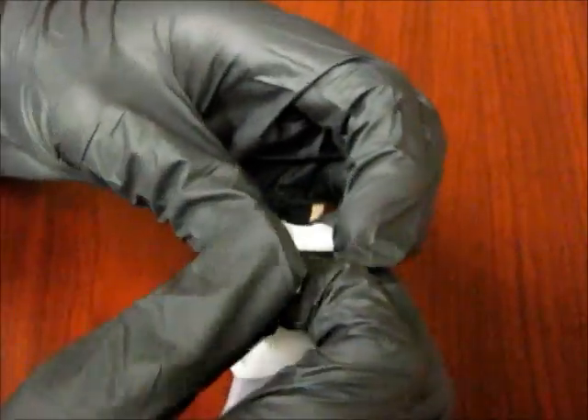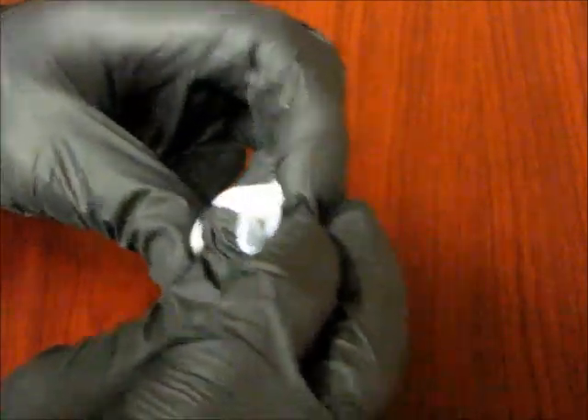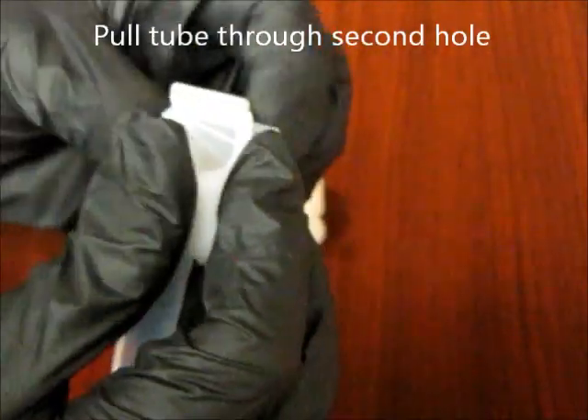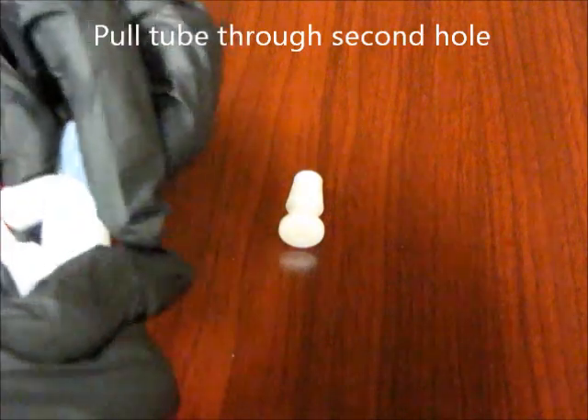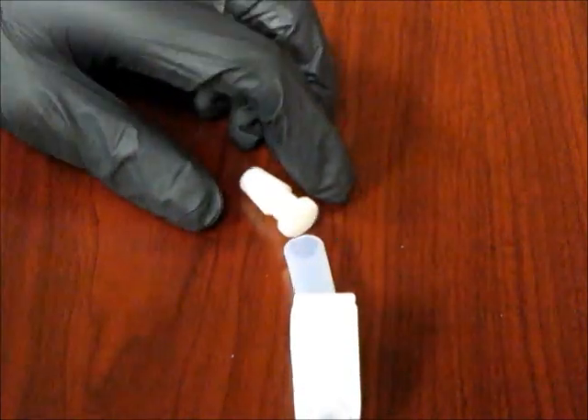At that point, you can begin threading the tube through the upper hole of the clamp. It is important to note that the clamp must always be facing outward towards the open end of the tube.